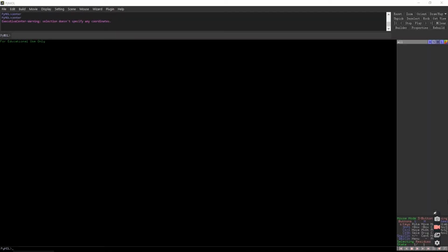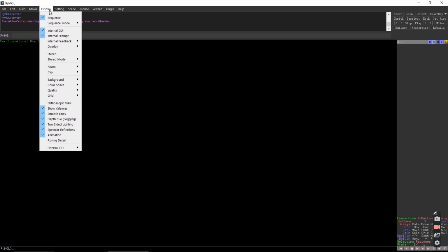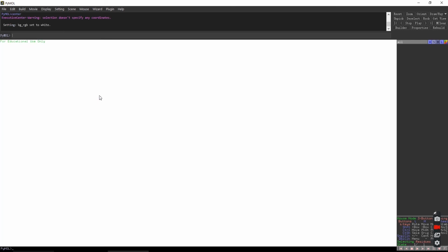Hi, in this short video I will guide you how to make a simple visualization in Pymol and how to use it for molecule modeling applications and how to make different kinds of visualizations, graphical representations and so on. So when you open Pymol, first of all you can change the color of the screen. Go to Display, Background, White. As a standard, usually we make all the pictures in front of white background.